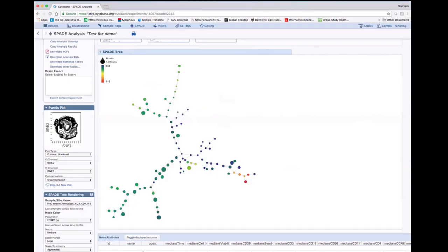To continue from what Sharam just explained, I will quickly go to Cytobank. Cytocluster is an application developed in R using the Shiny framework and Cytobank's API. The input data for this demo uses cluster data from SPADE in Cytobank, but as Sharam mentioned, it can be any other clustering algorithm for cytometry data. In this particular example, we have three patients: one healthy donor, one responder, and one non-responder to immunosuppression therapy.